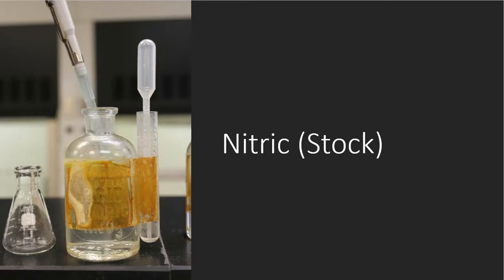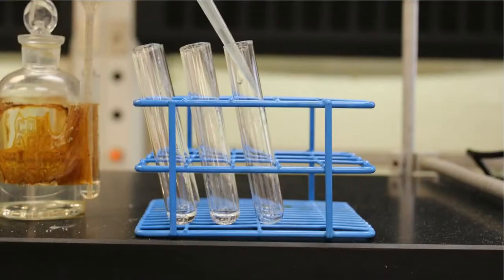And then I'm going to suck up very slowly the nitric acid into my micropipetter, and I will dispense it into a set of 3 test tubes. So test tube number 1, number 2, number 3, nitric, nitric, nitric. Again, remember, I told you that we're going to be doing this 3 separate times. And this one video is for 3 separate labs. Okay, so there's the addition of the nitric.